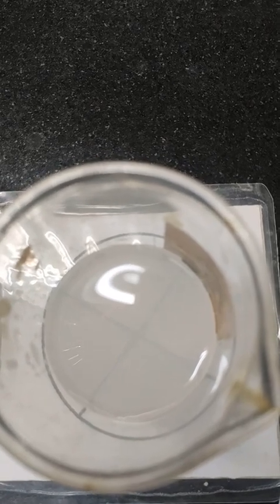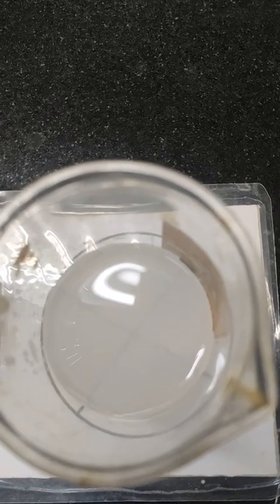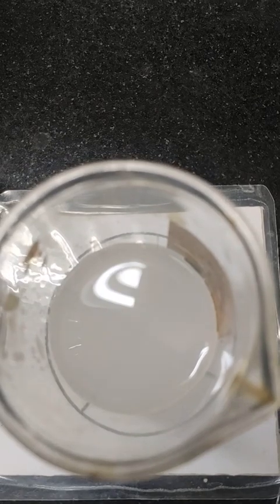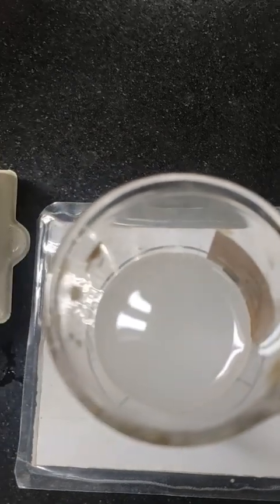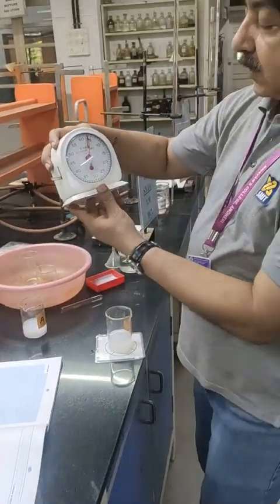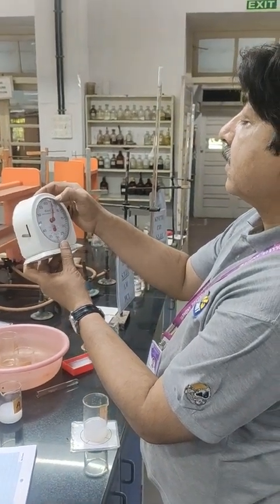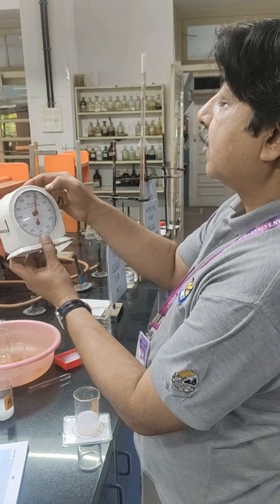As it is clearly visible, the mark is becoming faded. Slowly, the solution will become more turbid and that cross mark has disappeared. Now I will stop the stopwatch and I will record the time taken. So you can see from here the time taken is around 2 minutes and 3 seconds.